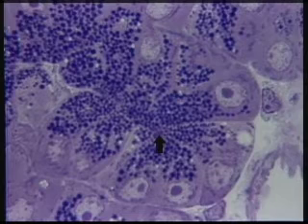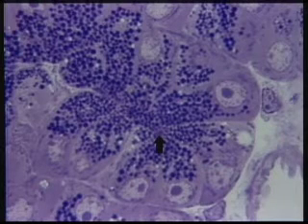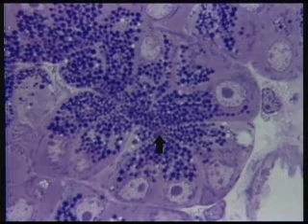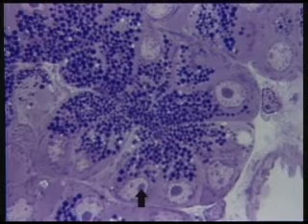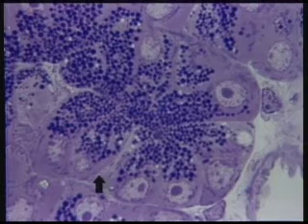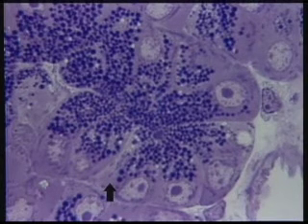Now this preparation is a light micrograph of a preparation that was prepared as you would prepare specimens for electron microscopy, so a tremendous amount of detail can be seen even at the level of the light microscope. This is not like standard histological preparations, but let's just have a look here. You have the nucleus here, nucleolus here, and these dark streaks are the mitochondria. You can actually see these quite clearly in this preparation. This dark area here is the rough endoplasmic reticulum.